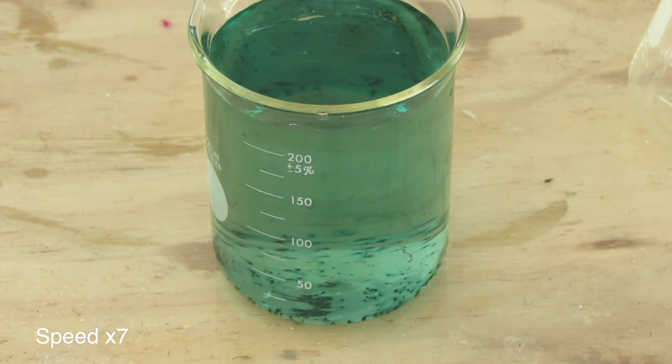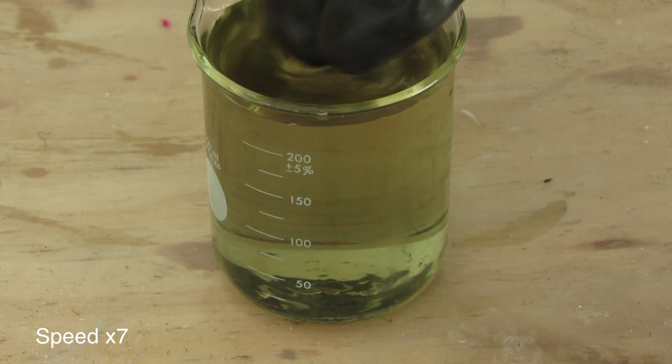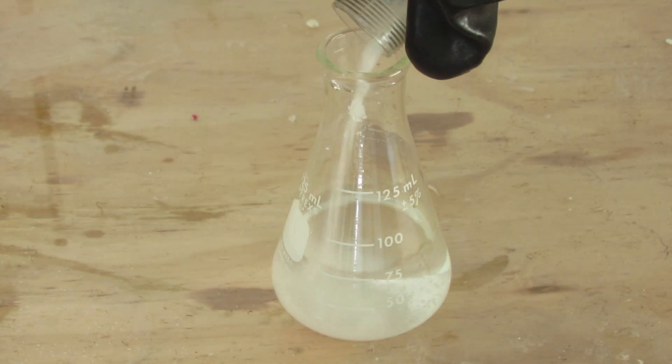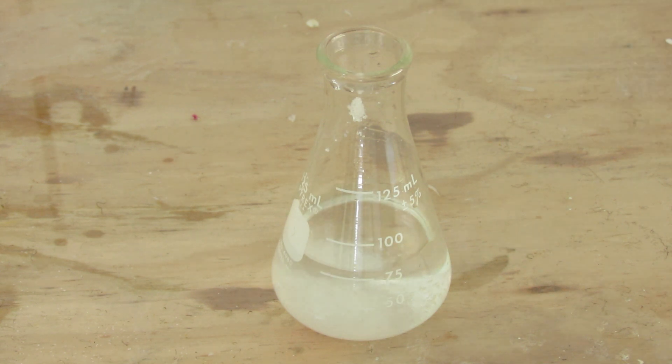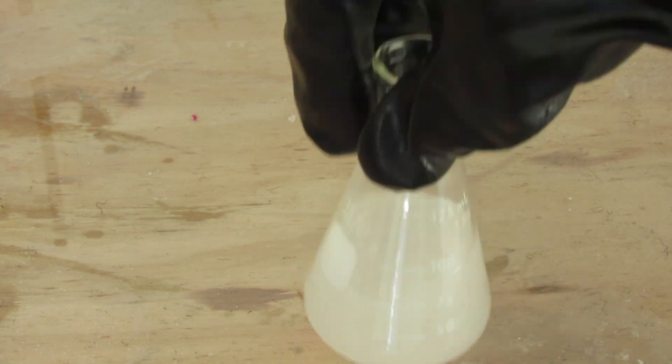Hello, welcome to Goofer King Science, and today we will be conducting the Chemical Chameleon Experiment. Start by dissolving 2 grams of sodium hydroxide and 1 gram of sucrose, also known as sugar, into 75 milliliters of water.